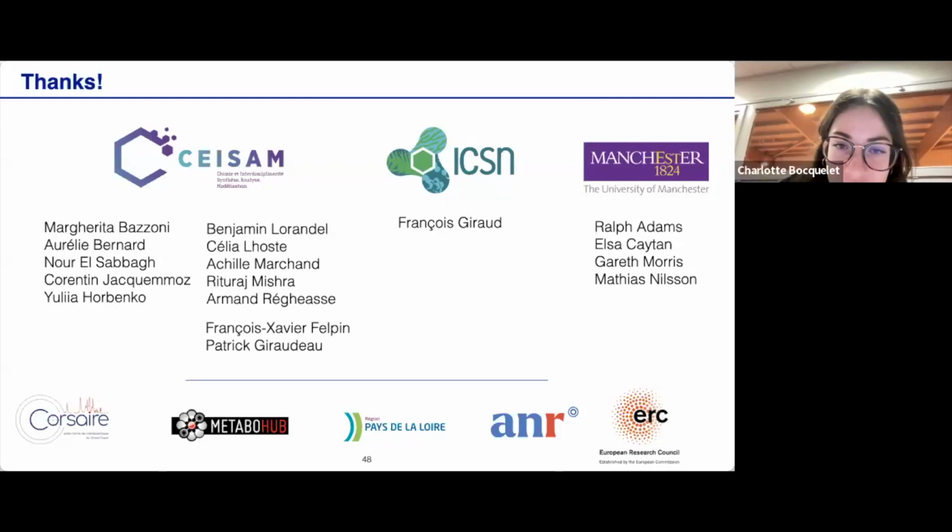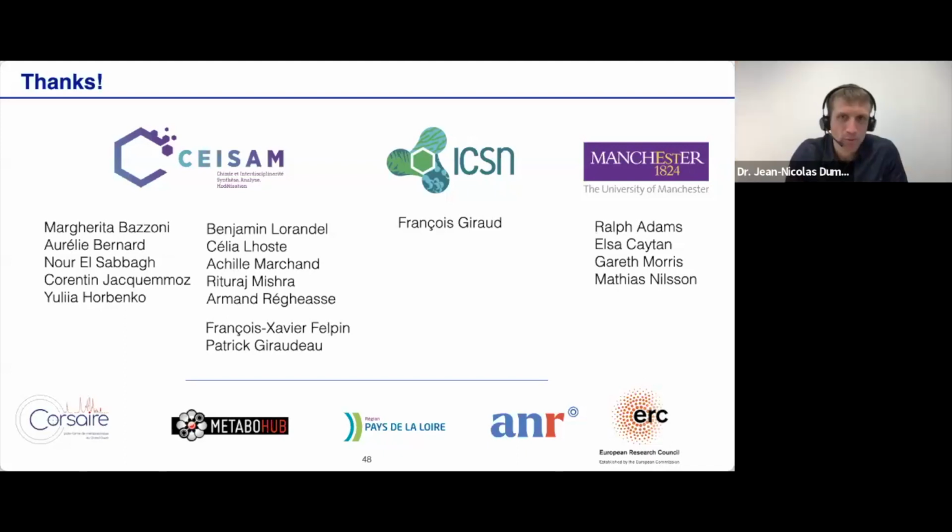Okay. So another question regarding the reaction monitoring by DOSY. In reaction monitoring by diffusion NMR, have you tested the effects of mass difference between the reactants and the products? I assume if the difference is not large enough, can you still do it? So, I mean, the way the question is asked, indeed, if the difference is not large enough, then it's not large enough, and then it's not separated. And it's a really good question of how significant does that difference have to be.